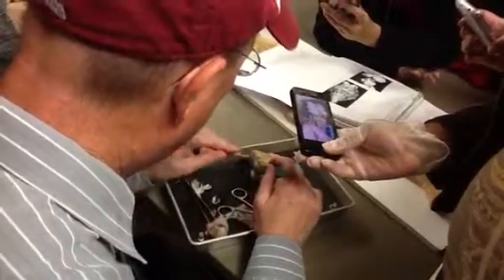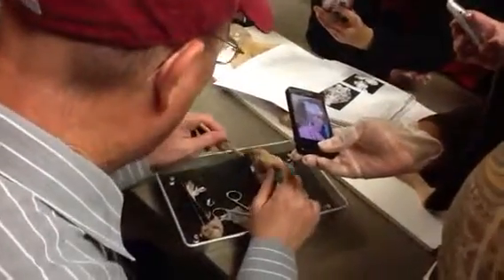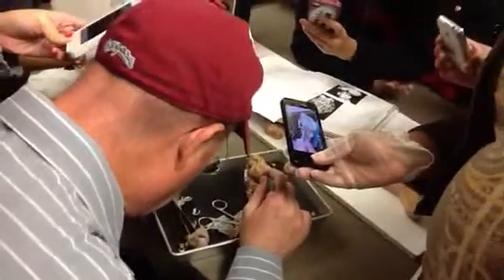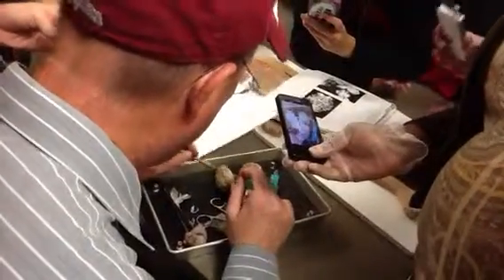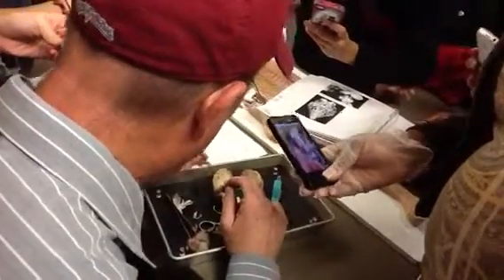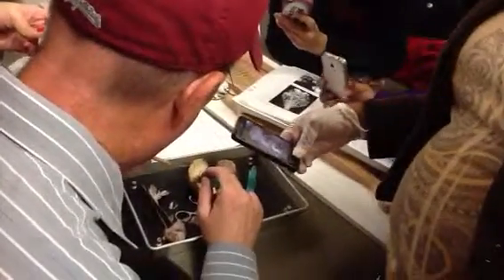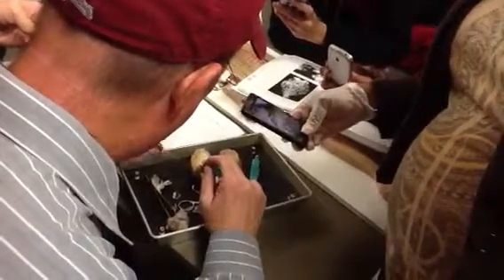is back here, and then the occipital lobe is back here, and the temporal lobe is down here. Okay, back to the side. Okay, now you've got the cerebral cortex is the gray matter on top. The cerebral cortex is the gray matter on top of the cerebrum.